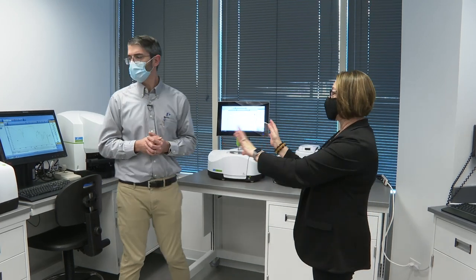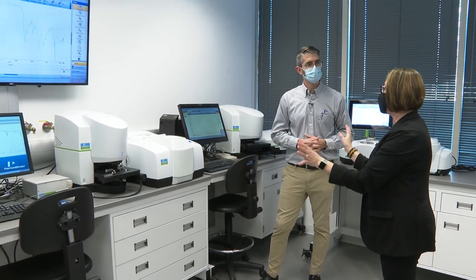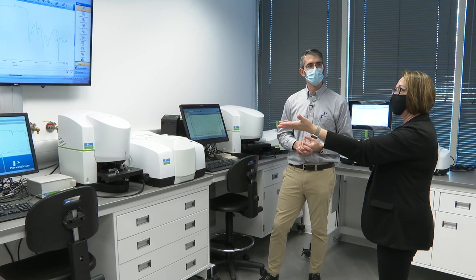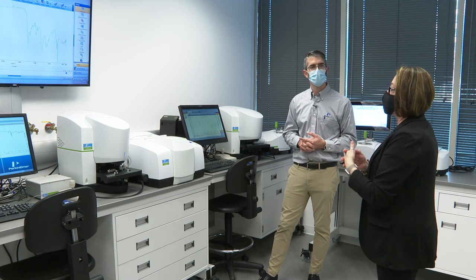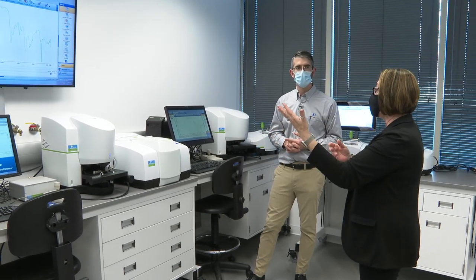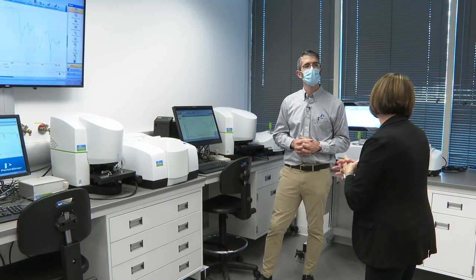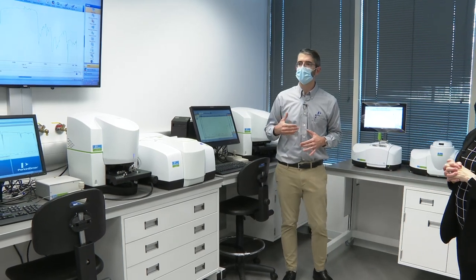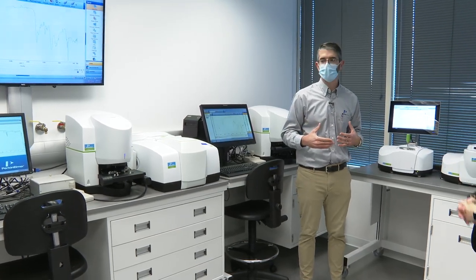Let's move over to some of these instruments — it looks like a lot of them have microscopes attached to them. That's right. Maybe talk a little bit about what we have going on here with an IR with a microscope and how we can utilize it for looking at not only impurities but multi-layer laminates, paint chips, packaging, etc. So either of our FTIR benches that we sell can be interfaced with an infrared microscope, whether it is the Spectrum 2 or the Spectrum 3 FTIR.